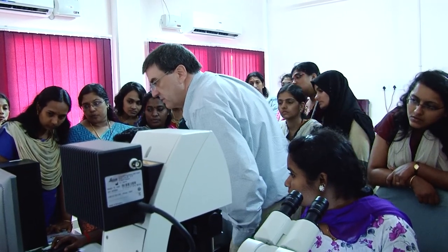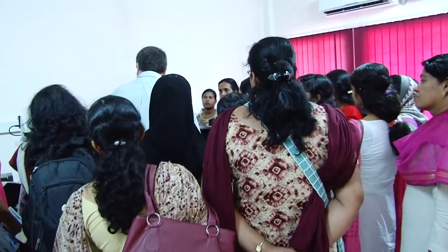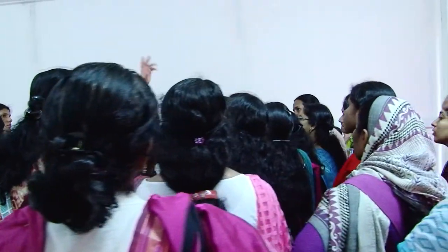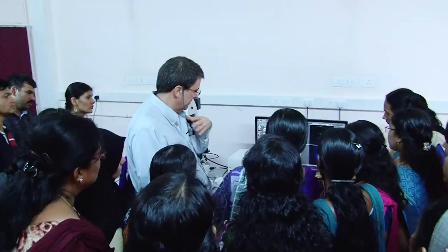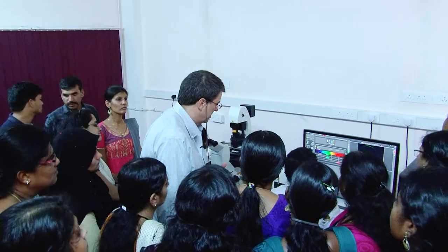Okay. Now he's just moving over, so it's a little more in the middle. In plastic, I had to use just this. This is the fluorescent light. I could not use the lasers because the lasers will just scatter the light all over. This will work for plastic, but as I think you've seen from the days I've been talking, glass, glass, glass if you can, because you'll always get a better image through glass.